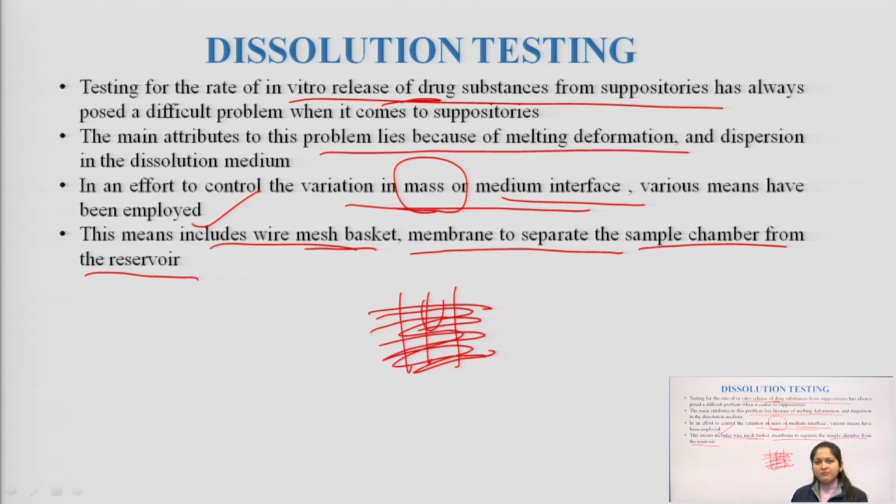This is how you can maintain its integrity properly, and the dissolution test can be done very carefully without any issues or disturbance. So a slight modification has been made here: we employ a mesh instead of the entire basket. Dissolution plays a very important role in understanding how much quantity of the drug enters into the media, and what is the highest concentration that has been achieved in the media. So, this is a very important test.